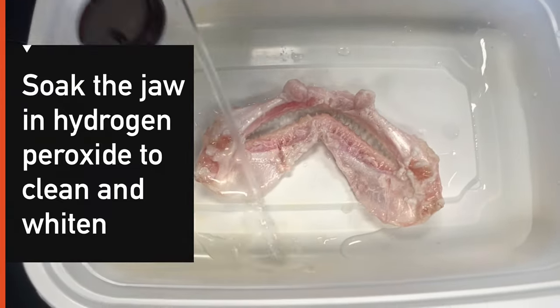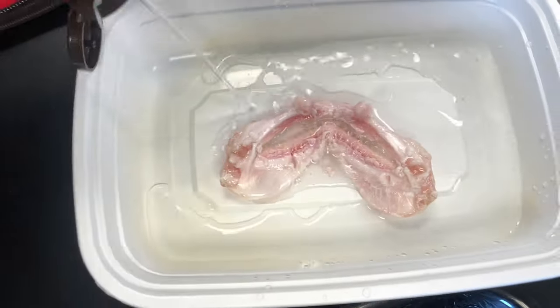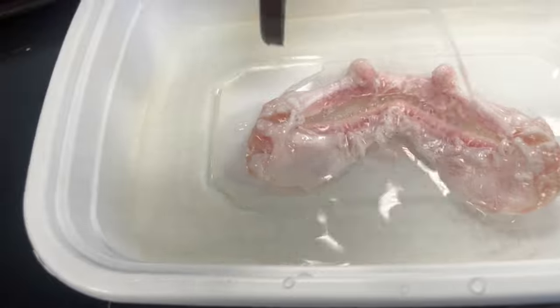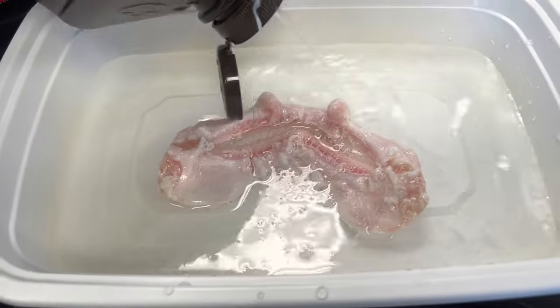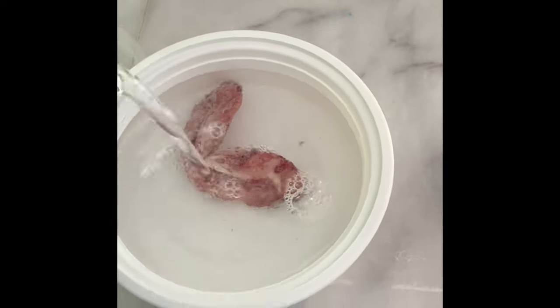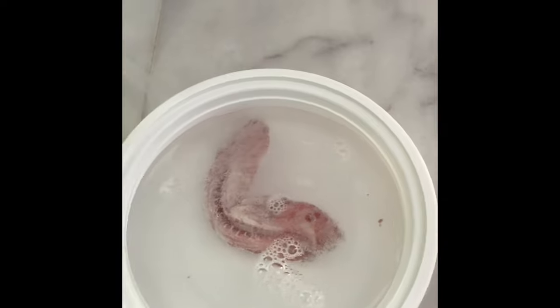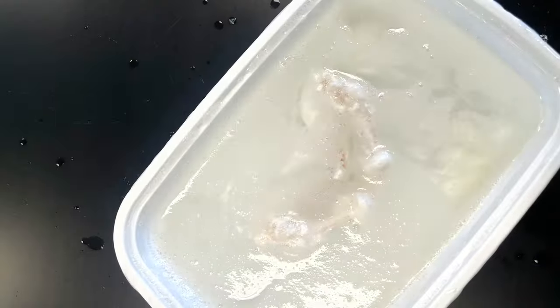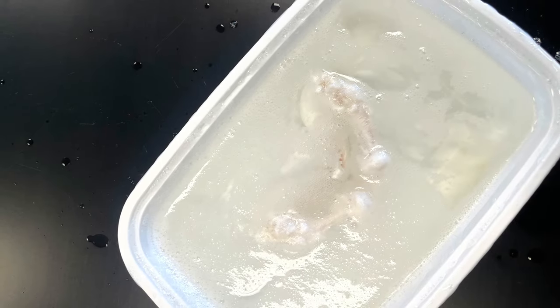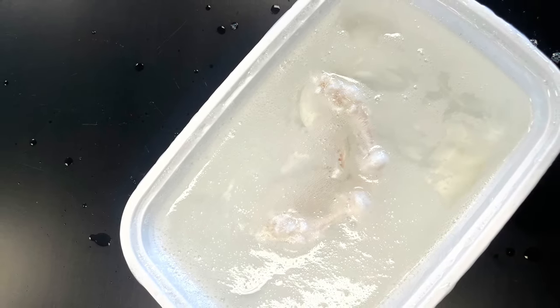Here is the female blacktip getting ready to soak, and here is the male blacktip — he's about to soak. Next you will let the jaw soak for 24 hours. Here you can see the second jaw, that of the female, starting to fizz in the peroxide already.